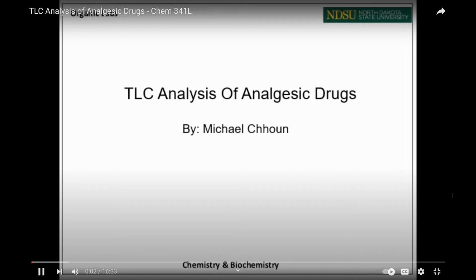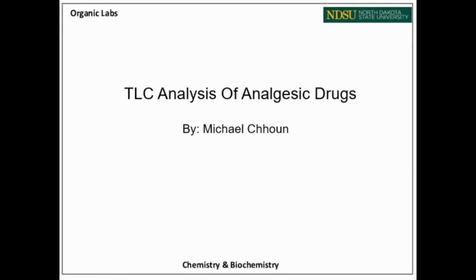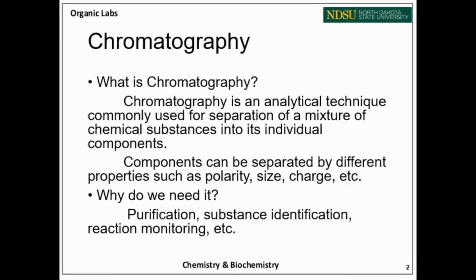Welcome to Organic One Lab, and today we will be performing thin layer chromatography for the analysis of analgesic drugs, or TLC for short. First, we're going to talk about chromatography and what it is used for.